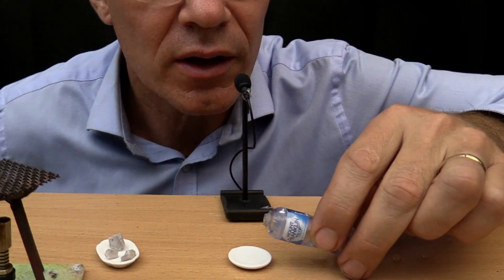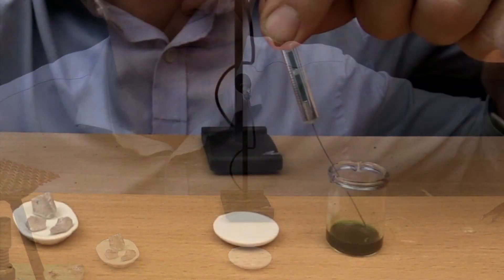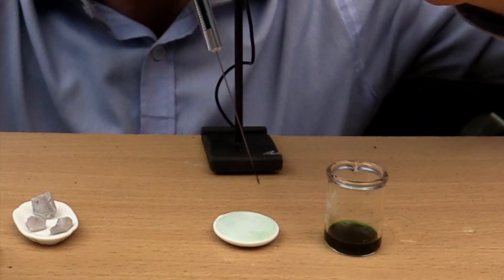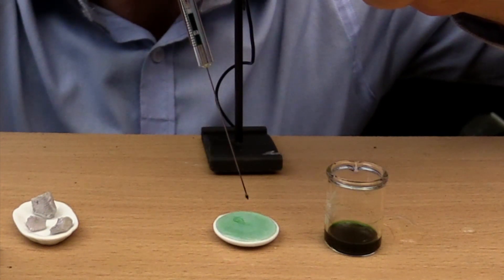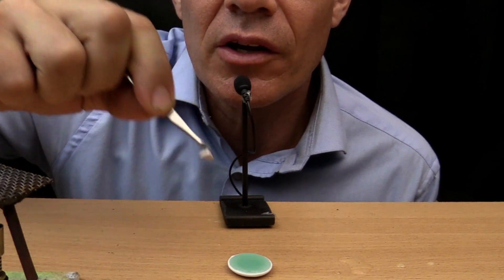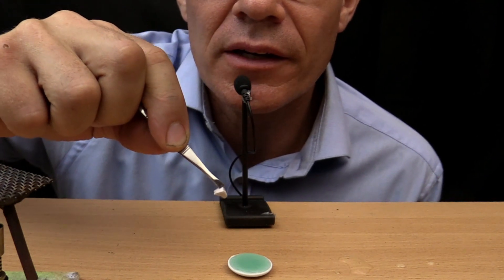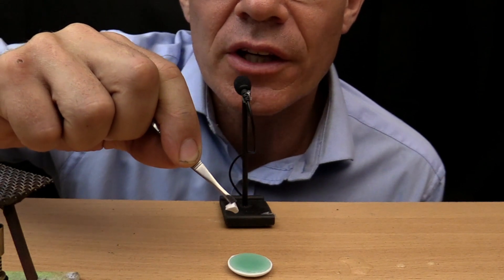I'm going to put some water in the little plate, and a drop of universal indicator. Sodium is very reactive, and I'm going to put it in the water now. This could be quite dangerous. Are you ready? Watch carefully.